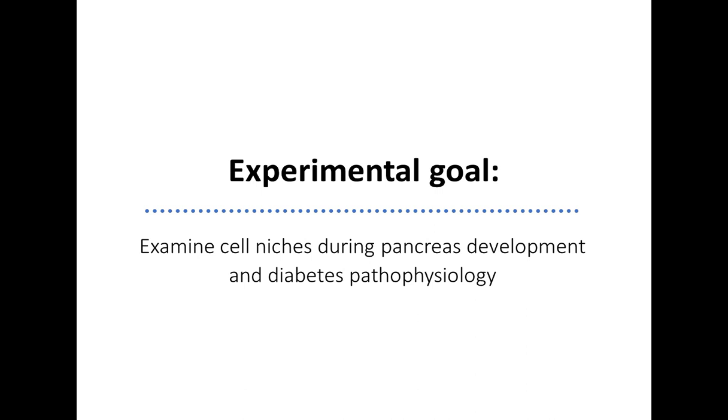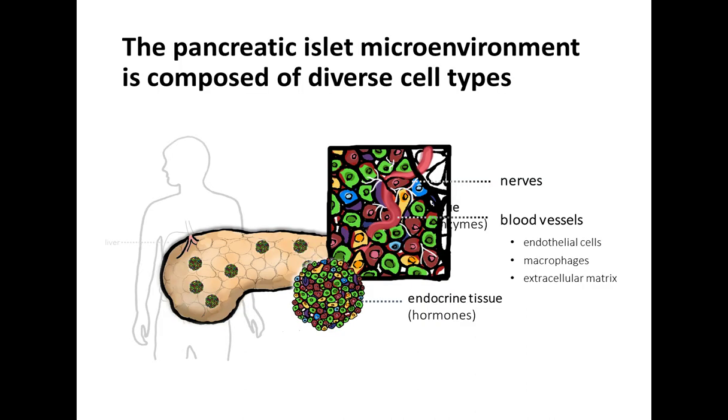So in the Powers and Brissova research group, we're particularly interested in understanding cellular niches during pancreatic development and also in the context of disease pathophysiology. The pancreatic islet microenvironment is composed of a lot of diverse cell types.